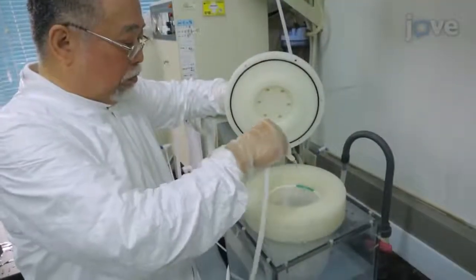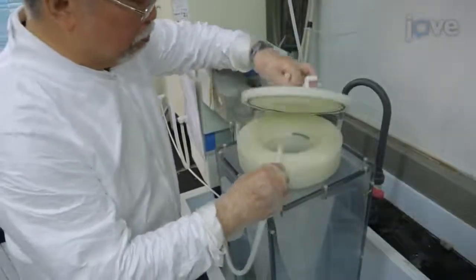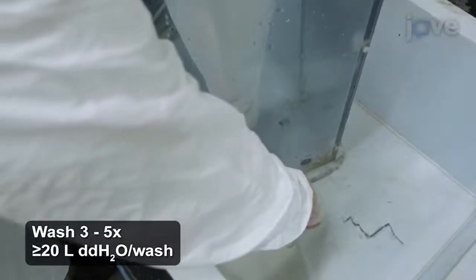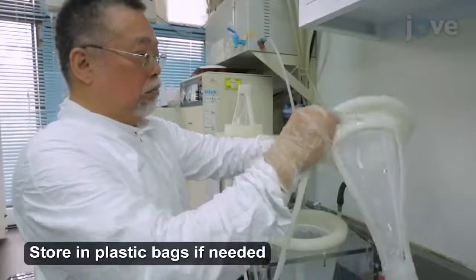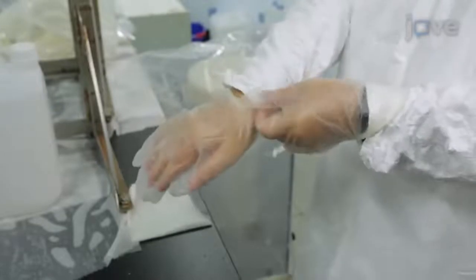After 72 hours of soaking in dilute acid, thoroughly flush the sampler with reverse osmosis double distilled deionized water 3 to 5 times, using a minimum of 20 liters per flush. When handling the cleaned sampler, always wear polyethylene gloves.